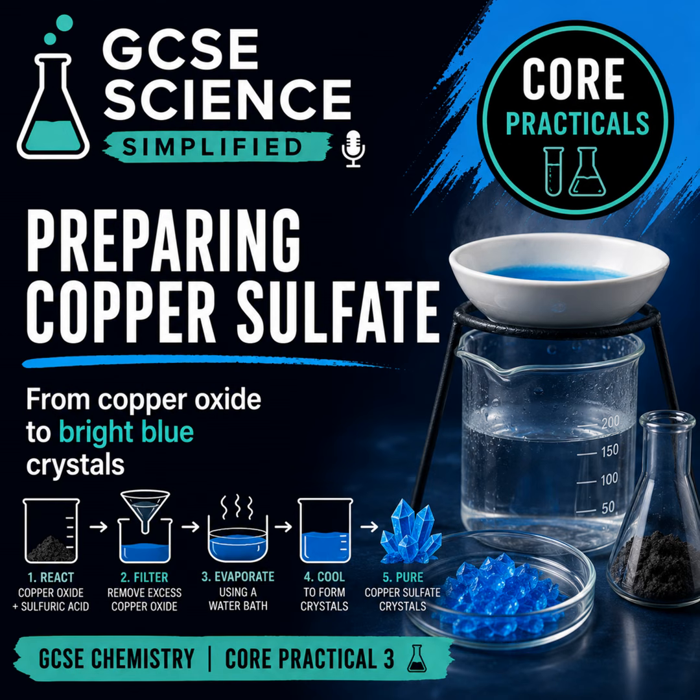Right, safety and skills. We're working with sulfuric acid. This can be corrosive. Our hot liquids are potentially going to burn you. So, we need to heat it gently, handle carefully, wearing eye protection. And skills, we need to ensure that we're using a measuring cylinder to measure volumes, a glass stirring rod, beakers, and a water bath, naming our equipment as we go.